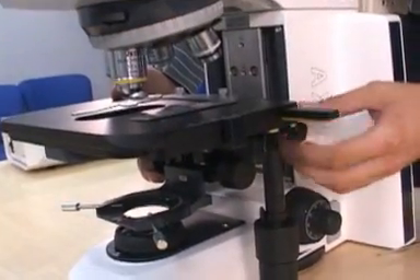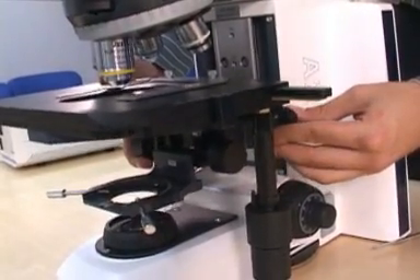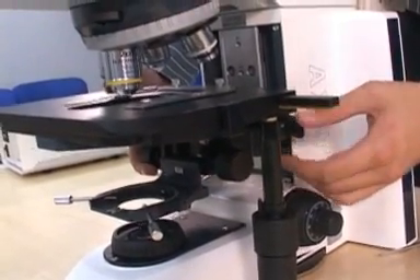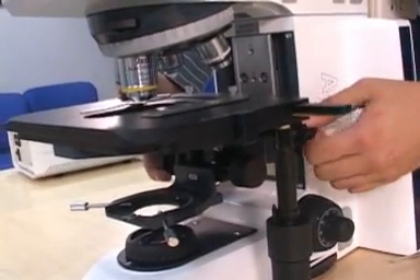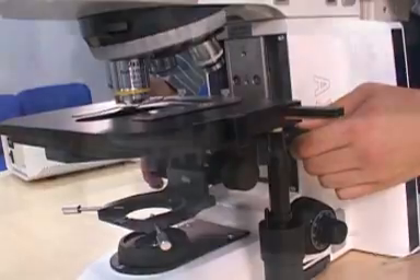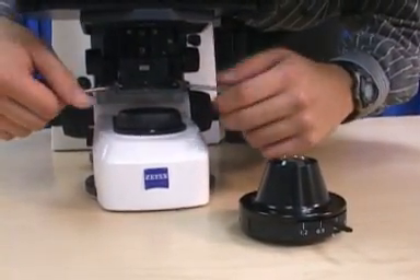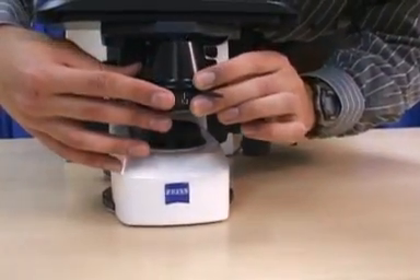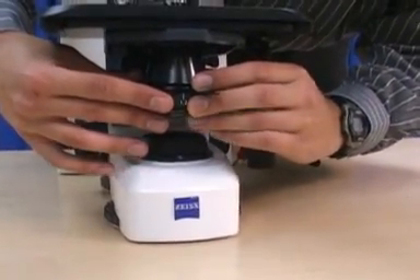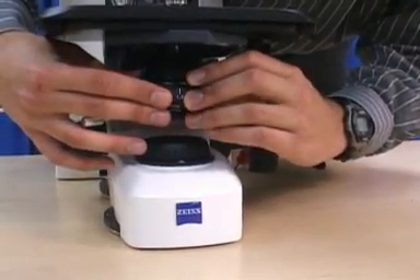Slightly tighten the thumb screw. Slide the stage-condenser carrier upwards until it rests firmly against the upper limit stop screw marked with a zero on the focusing dovetail. The thumb screw can now be tightened completely. Flip out the top element of the condenser with the right or left lever and insert the condenser into the condenser carrier by slightly tilting the front of the condenser upward and pushing back against the spring-loaded pin until the condenser sits snug in its mount.